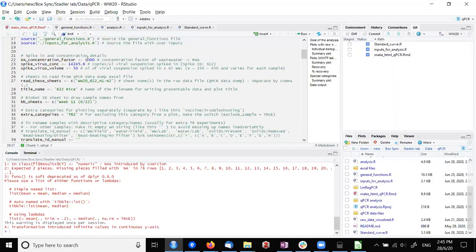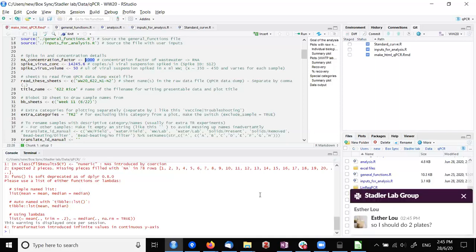What do you mean? Well, in the extraction process, there's some volume that you're missing out, right? Yeah. I don't have that information, so I haven't been able to put it into the code. Okay, I have that information and I can help add it. Sure, yeah, we just have to rerun the old data probably.